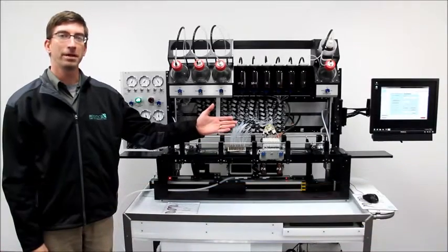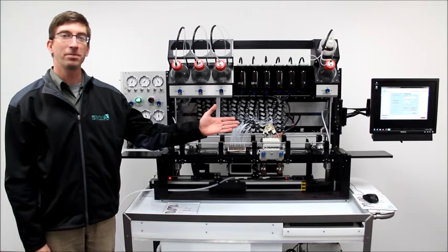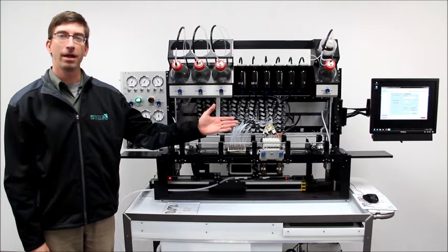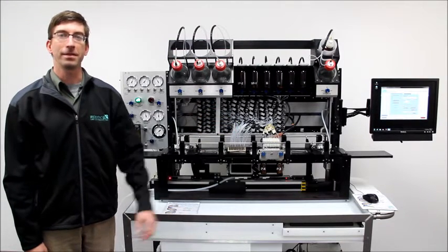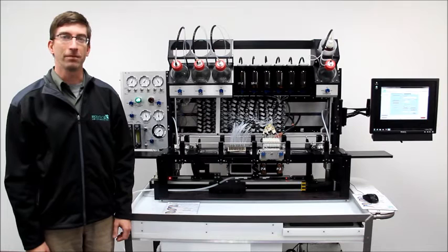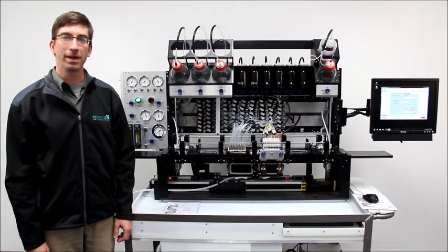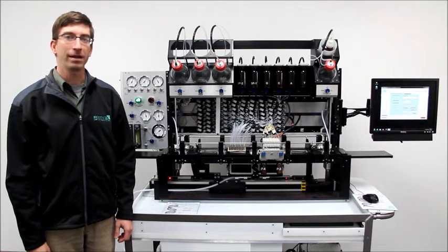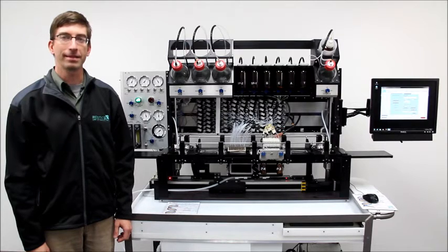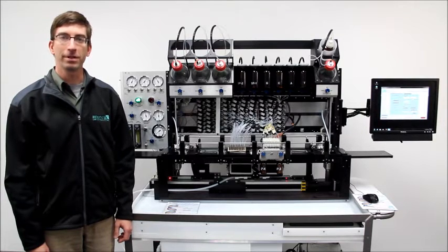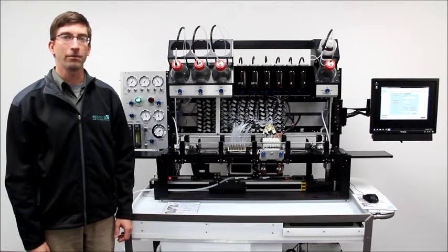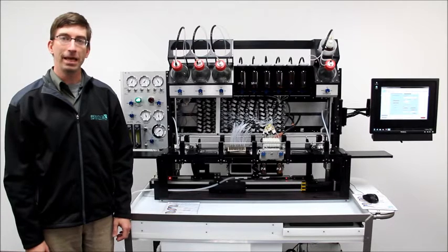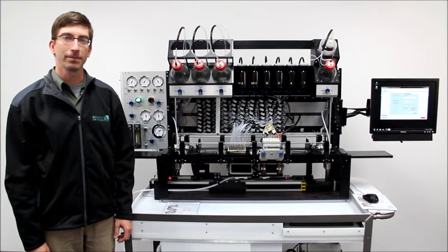The Dr. Oligo 192 is the world's premier platform for high-throughput oligonucleotide synthesis. It is designed to be versatile, user-friendly, and robust, compatible with a variety of chemistry systems and synthesis options. The instrument and software are fully customizable to meet any production synthesis requirements.